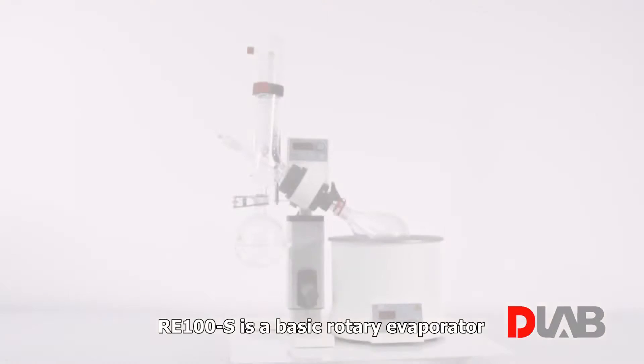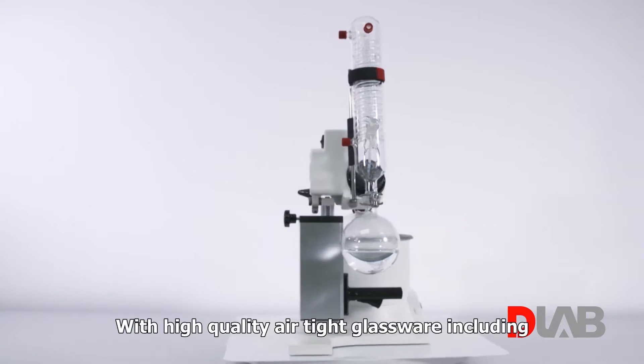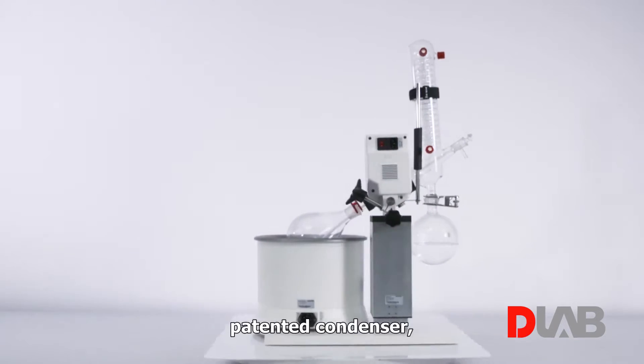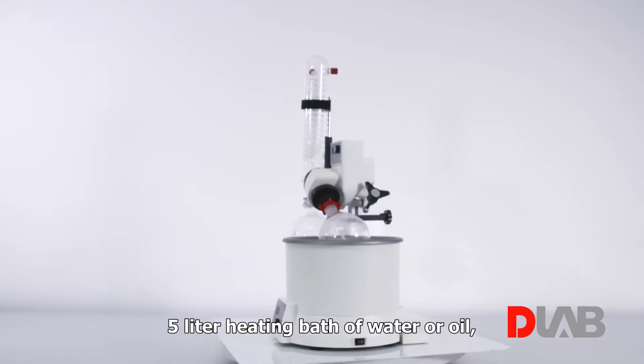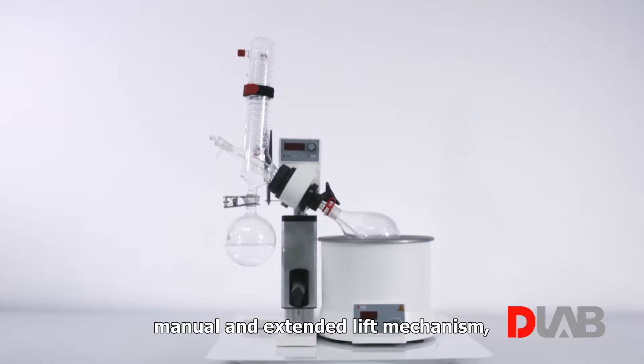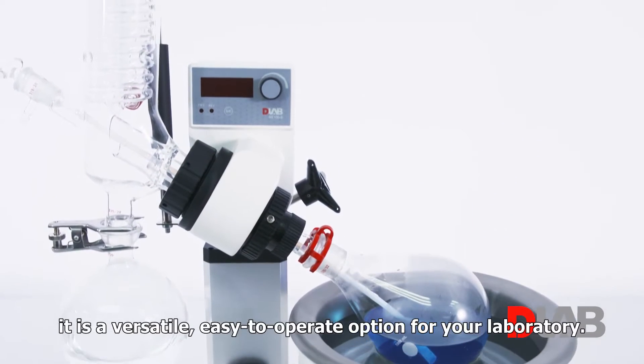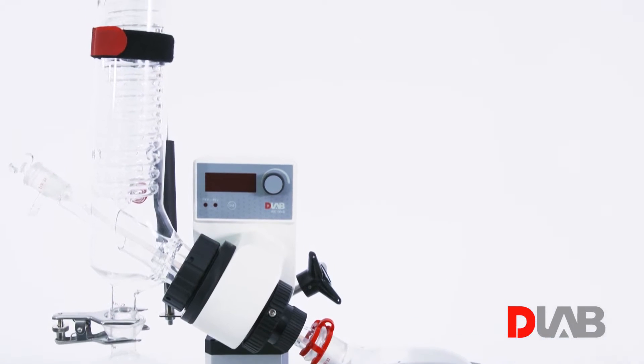RE100S is a basic rotary evaporator developed by D-Lab, with high-quality airtight glassware including a patented condenser, a 5-liter heating bath for water or oil, and a manual and extended lift mechanism. It is a versatile, easy-to-operate option for your laboratory.